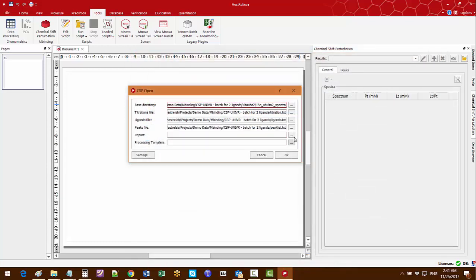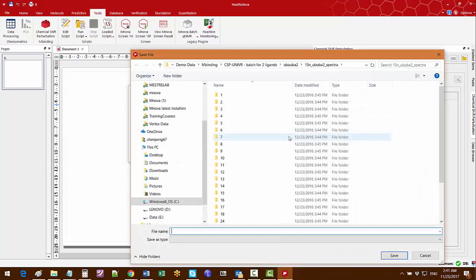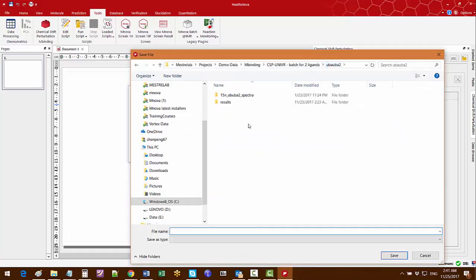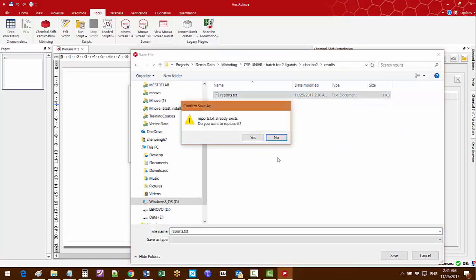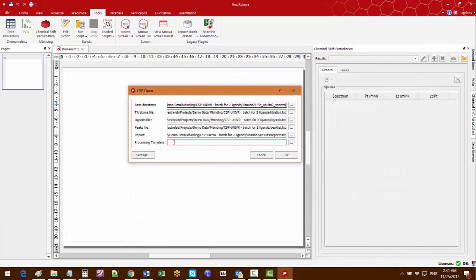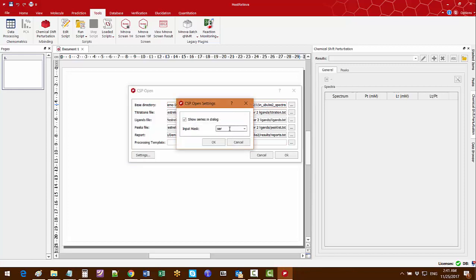Here we also specify the name and location of a report file. Optionally we can specify a processing template file, although in this case we are going to just use the default processing parameters. In the settings we make sure we are using the SER and the 2D FID files to reprocess the spectra.